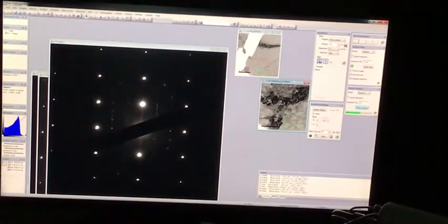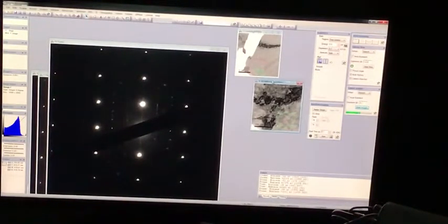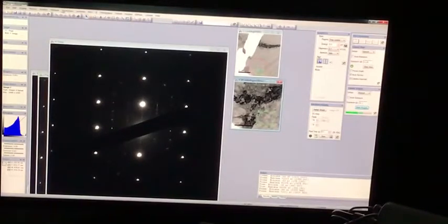And this, put an annotation in here. No, it's too big. Uh-oh, come on. So what I want to do is show you how all the images are related.